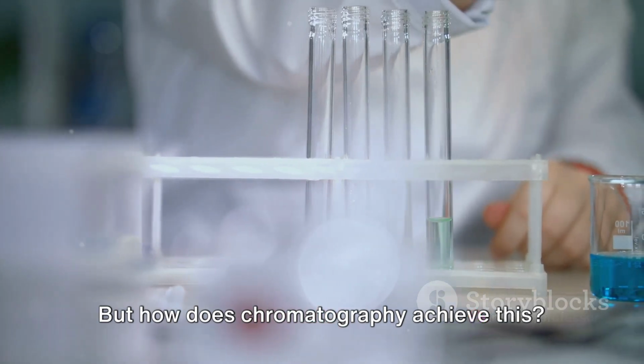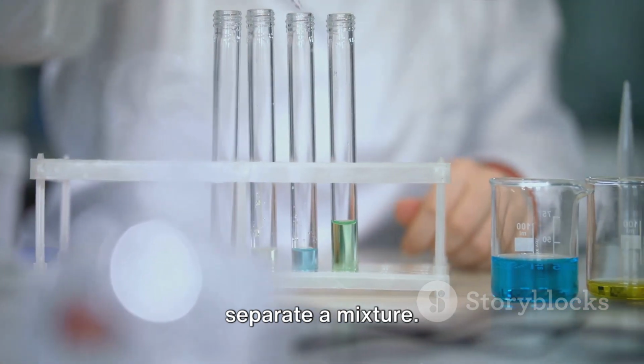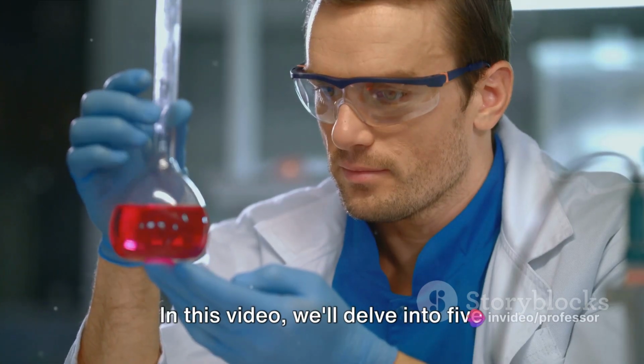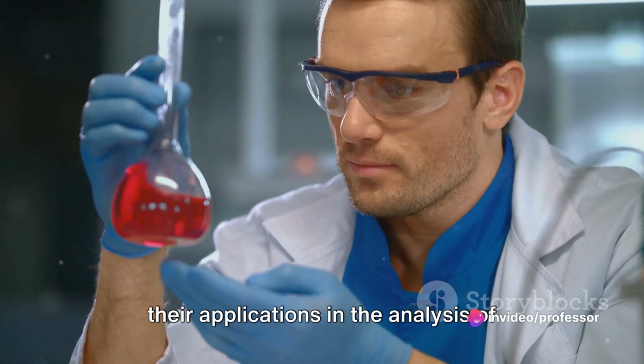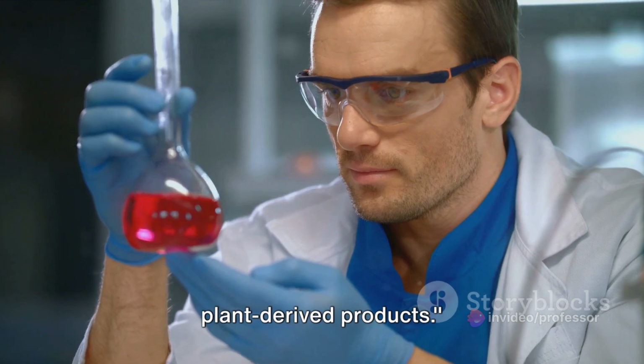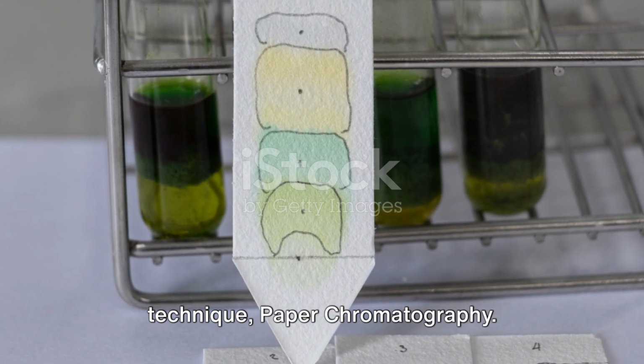But how does chromatography achieve this? Well, there's more than one way to separate a mixture. In this video, we'll delve into 5 chromatographic separation techniques and their applications in the analysis of plant-derived products. Let's start with a simple yet effective technique: paper chromatography.